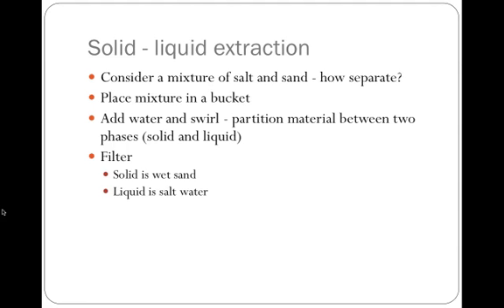A more efficient way would be to put the entire mixture of salt and sand in a bucket and add water. Swirl it around with a stick for a while, and what you'll find is that there's then partition between two phases. There'll be leftover solid, and there'll be a liquid phase. If you filter those two phases away from one another, what you'll find is that all the salt dissolved in the water. And so the liquid that you've separated away would be salt water. Presumably you could evaporate away the water and then have salt reasonably pure. And then the solid's going to be wet sand, which when it dries out is going to be pretty much pure sand at that point. That's the essence of a solid-liquid extraction.